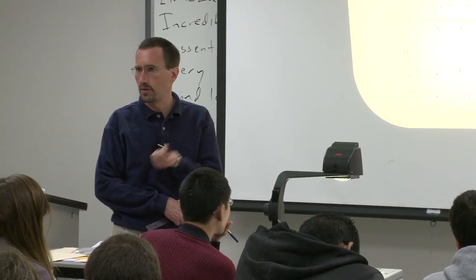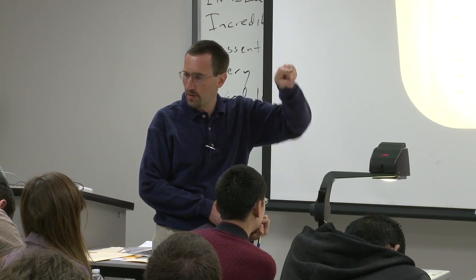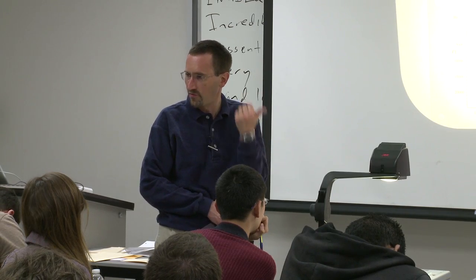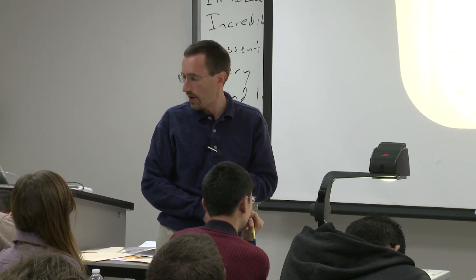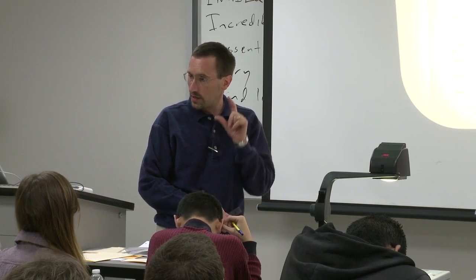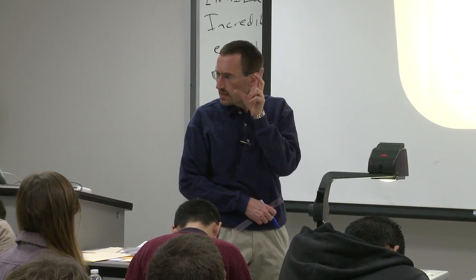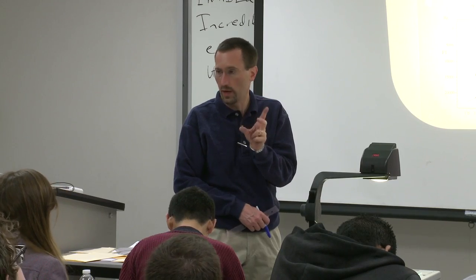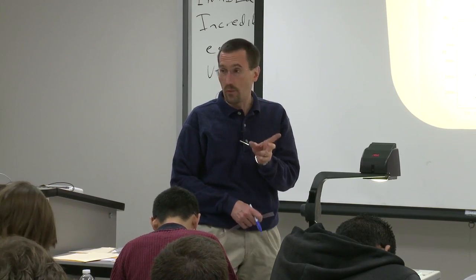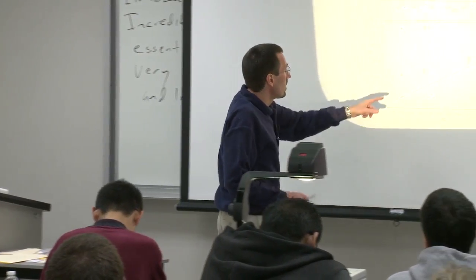We already saw on that Santonin problem, that very nice sesquiterpene problem, that darn peak from 4 to 7E, which, by the way, I've now put a note on in the problem. So we have seen that in some cases you can get some longer range coupling showing up. It's surprising. So I wouldn't say never, but it would surprise me.